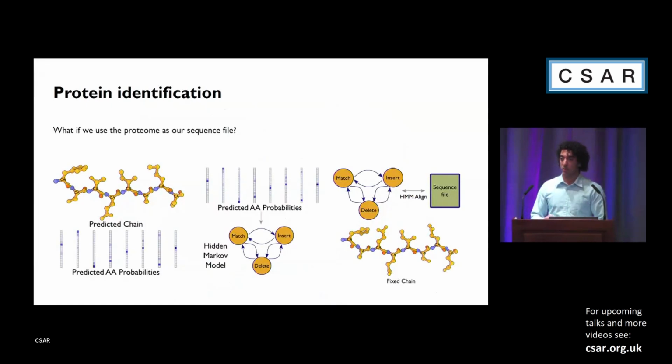But nowadays, what people really do is they take proteins, purify them from cells, so endogenous sources, and for big complexes, that isn't just your specific protein of interest. It's a complex of different things and can include many different proteins that no one had associated to that complex before. And now all you have is some volume with shapes, and you don't actually know what everything that is included in that volume is.